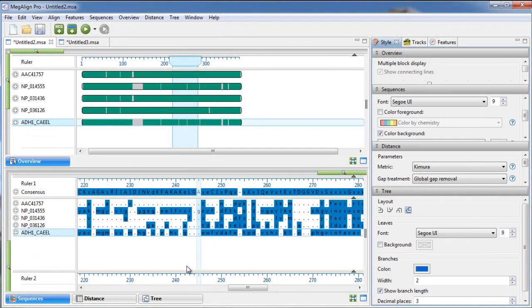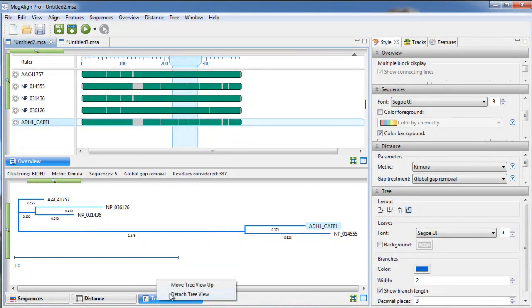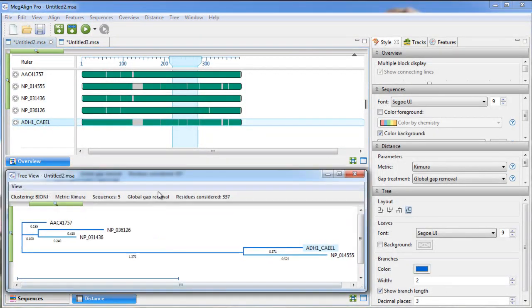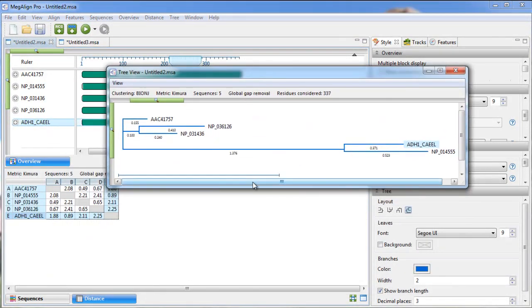All of the views and panels in Megaline Pro can be rearranged or undocked as desired to customize your user interface.